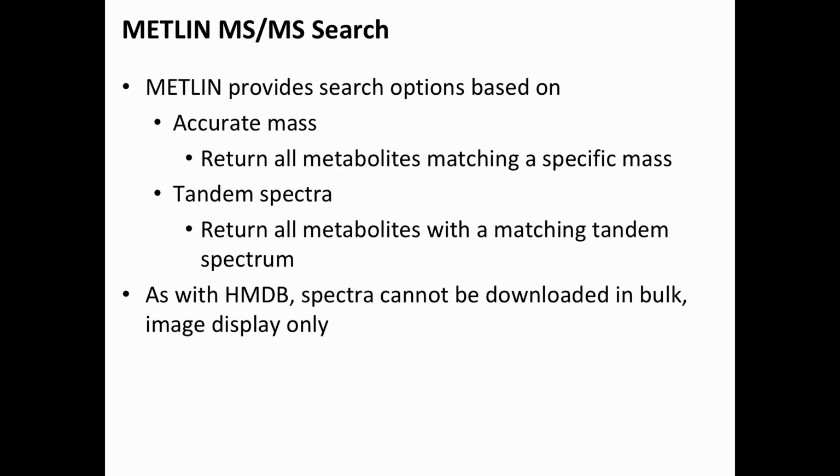So a second approach was, let me finish on that. People have tried many things to increase this accurate mass search, but basically once you're at the composition, you have to deal with this ambiguity. And we discussed that yesterday a bit. You can try and go for retention time. That is what people do in gas chromatography a lot, GC retention time indices.